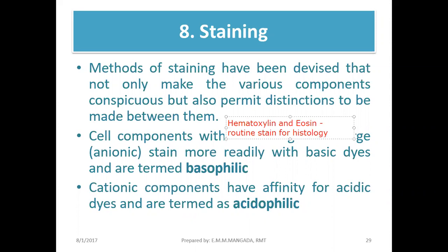It's actually regressive. Bakit siya regressive? Kasi it actually has this step where we employ alcohol. Okay? The purpose of that is to decolorize and to produce contrast. Kasi dalawa yung ginagamit natin.